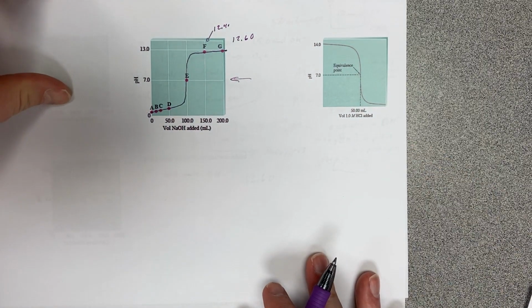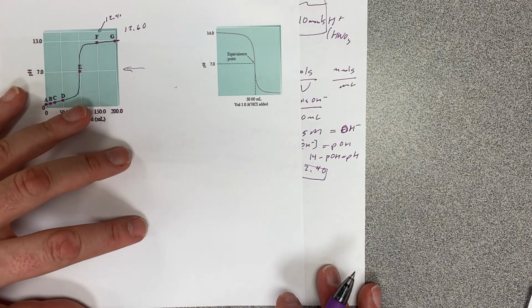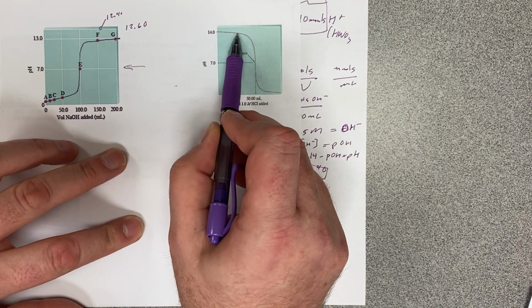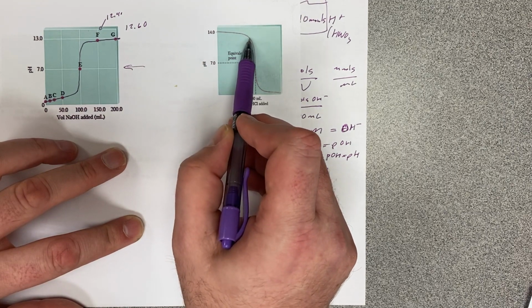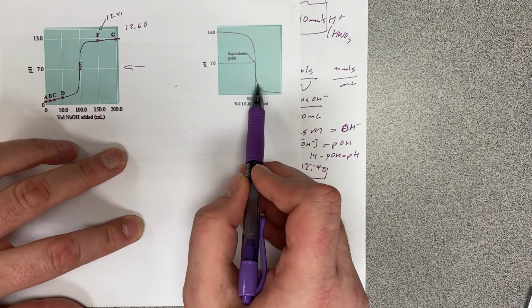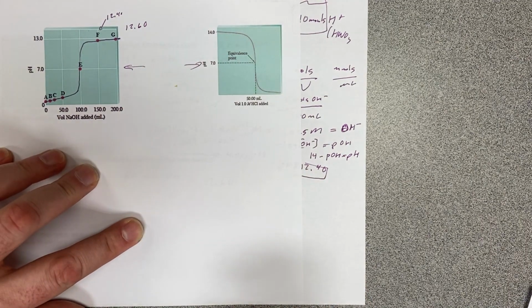Now, the exact opposite occurs when we're titrating a base. See how we start off at 14 and we go kind of on a very slow angle until we get close to the equivalence point, and then we shoot down and then even out. These two graphs are opposite of each other.